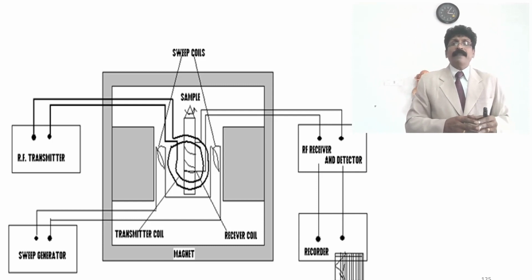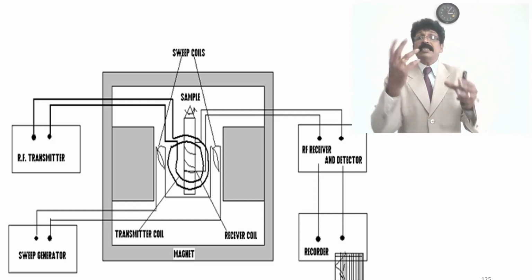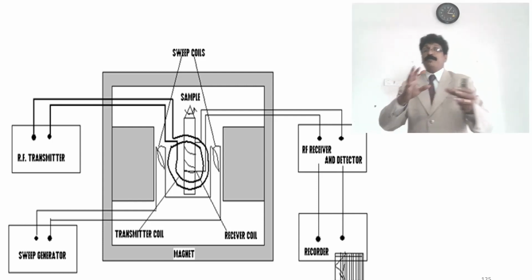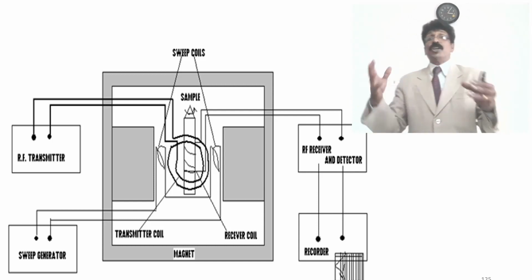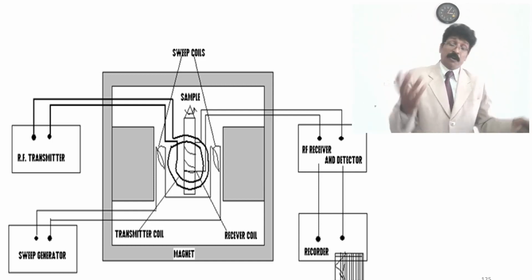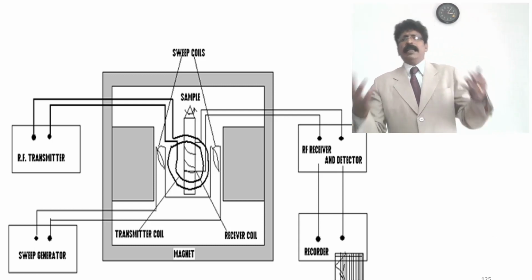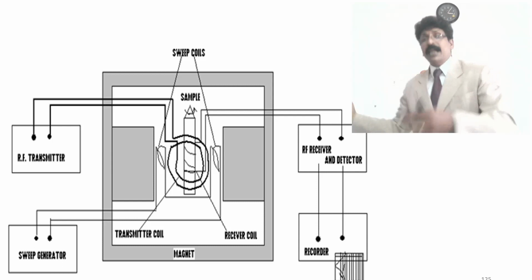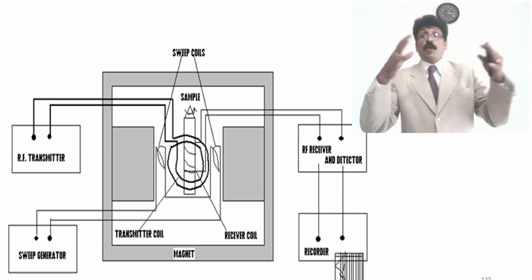And then you can see there is an RF receiver. The change in the molecule: the molecule can have a chemical shift, and you can see de-shielding and shielding. These words will be occurring. And there are some limitations, NOE, and many terms which we will be studying in detail in your analytical chemistry or instrumental analysis. I am not going into that detail.